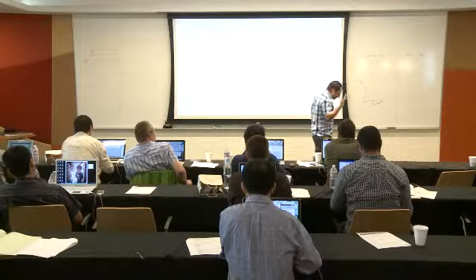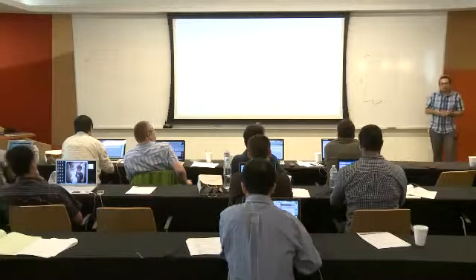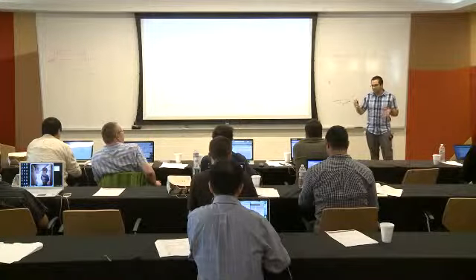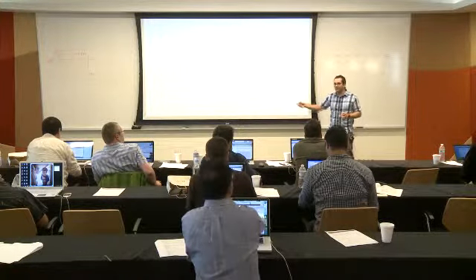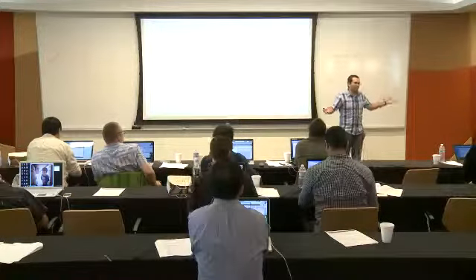And just one word about normalization. The way that we're doing it now, since when you do ChIP sequencing, it's not necessarily that you're going to get the same number of reads in both instances. So you can do ChIP sequencing for sample number 1, and you're going to get 10 million reads, and for sample number 2, you're going to get 30 million reads.